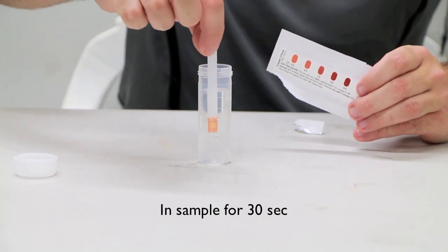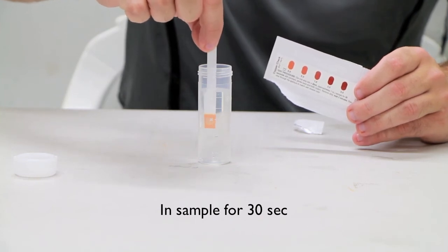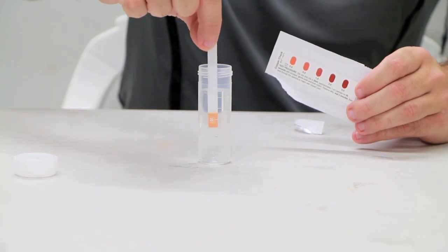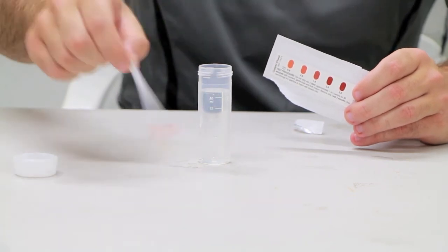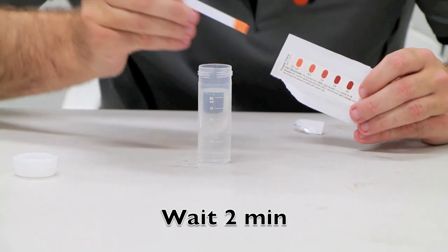Remove the strip from the foil and place the strip into water, moving it back and forth for 30 seconds. After 30 seconds, remove the strip from the sample and wait 2 minutes.